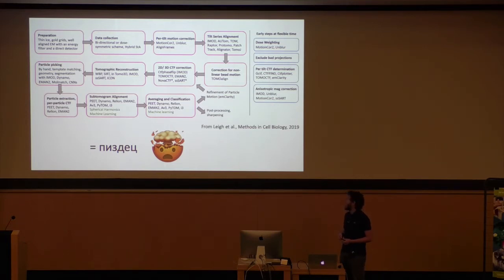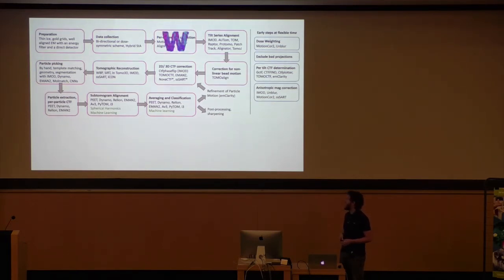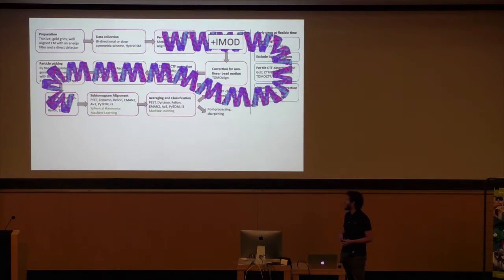So Warp comes in here, and then takes you all the way through this without any interruptions, seamlessly, and then lets you reconstruct subtomograms that you can pipe into RELION to do global alignments and classification. And then you can pipe RELION's results into a new tool called M.